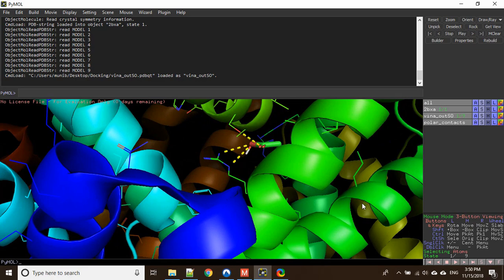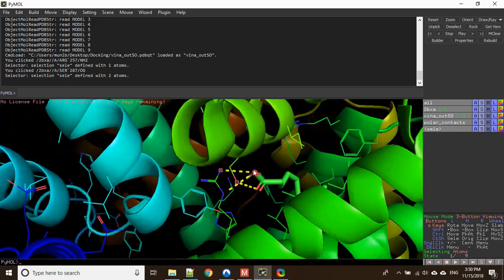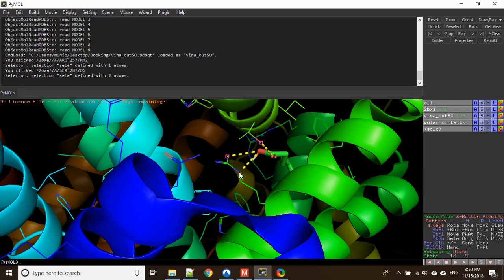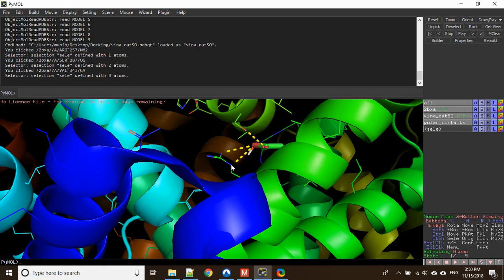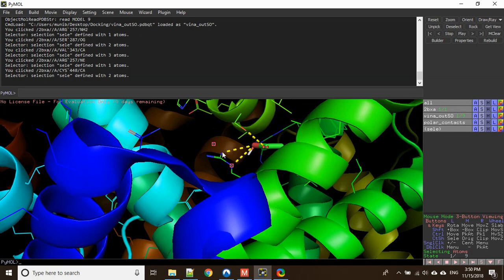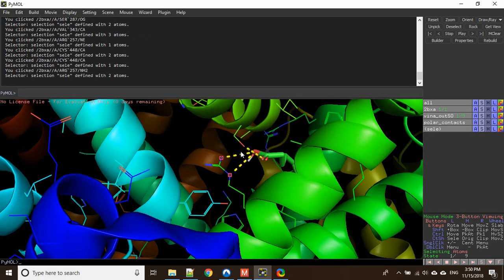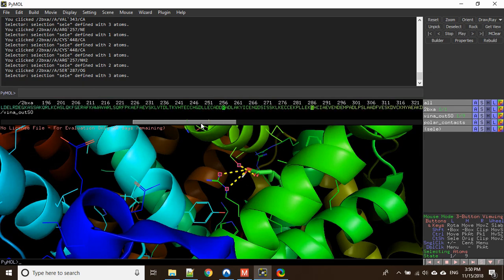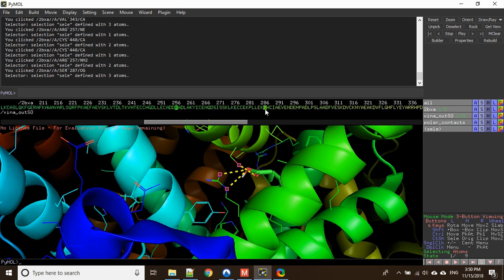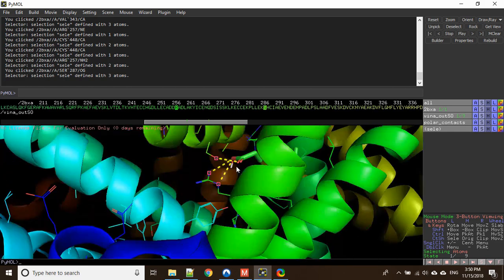We need to check whether these residues are the binding residues or not. To check it, you can select the atoms — this one, this one, and this one. Now in order to see what the sequence of your protein is, click on 'S' down below. These are the two residues which I have selected: Arginine 257 and Serine 287. Both of them are the binding residues for HSA.